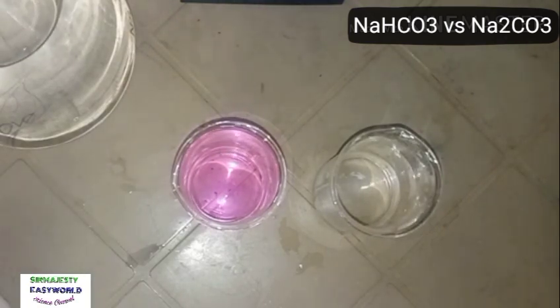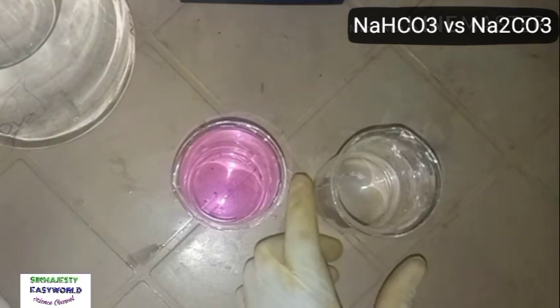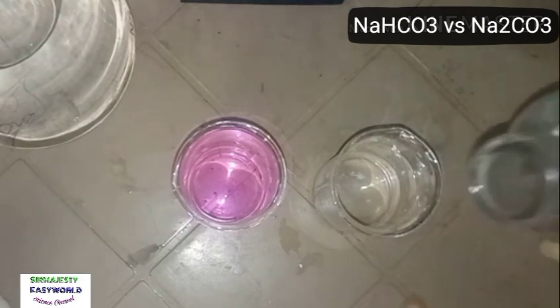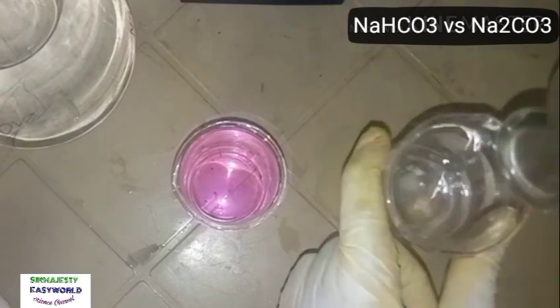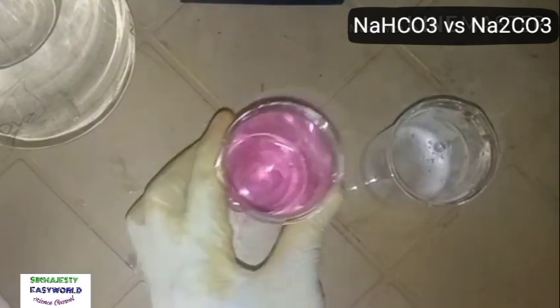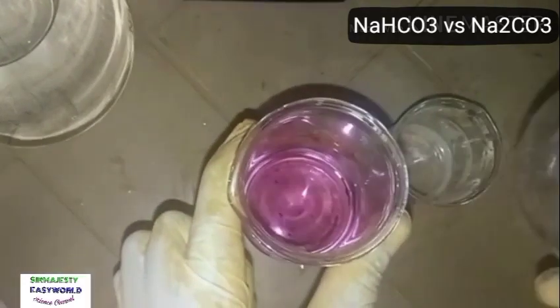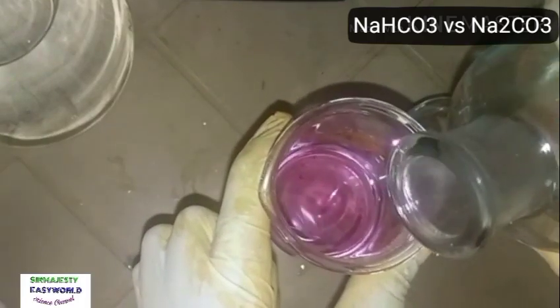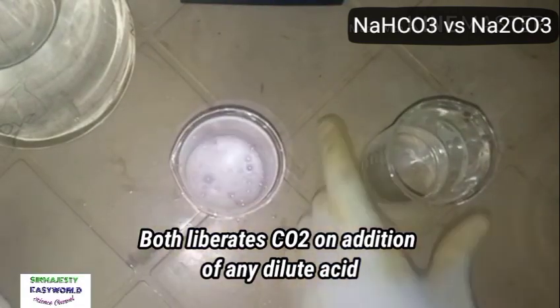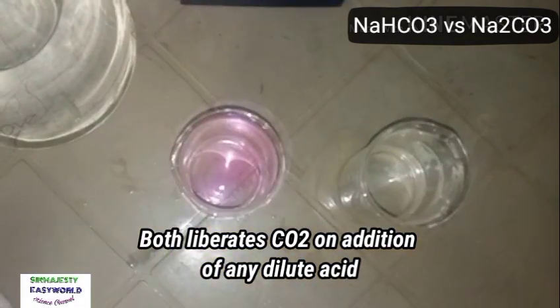Then you can now check what they have in common. These two, of course, if you add acid to any of them, both of them will give effervescence. Any acid, H2SO4, HCl will do that. Even though it's bicarbonate, there will still be effervescence. And remember, if I add acid here, this color will disappear if the acid is enough, because that's neutralization, but we'll see the effervescence. So both will give you effervescence in the presence of dilute acid.